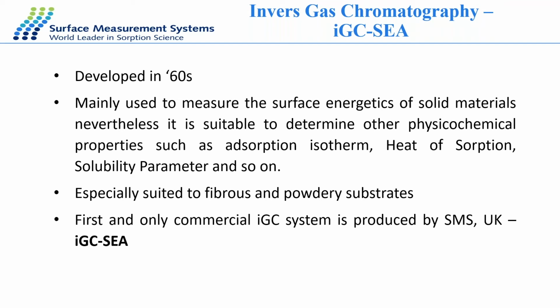IGC is especially suited to fibrous and powdery substrates, but it can also be used for other types of morphology, like granules or some other materials like films or membranes. We also used to measure some sponge with IGC.